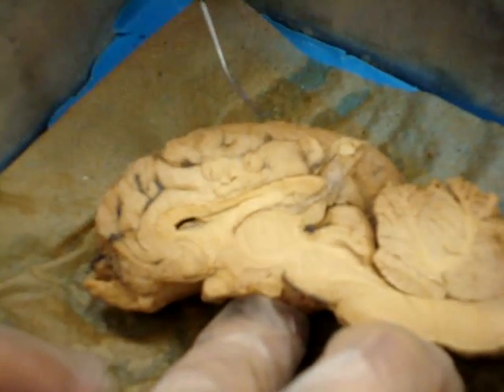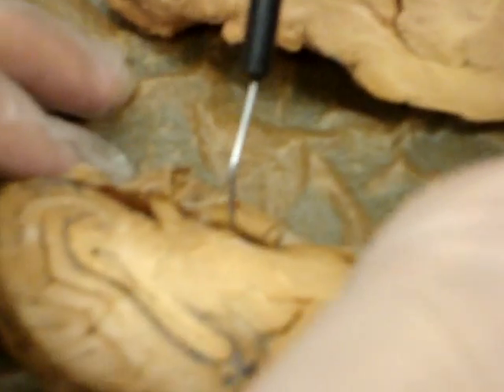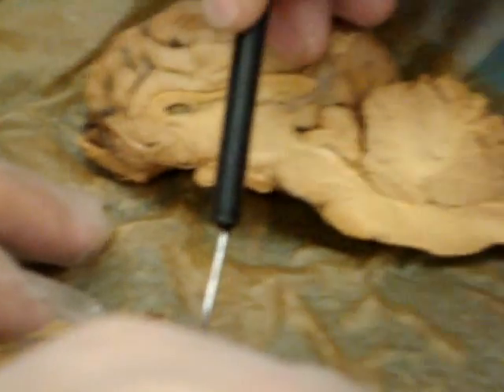the pineal gland. Did we do the thin skin? Up top? That is called the spider stuff. Arachnoid. This thick stuff is the dura mater, right? Thick stuff is the dura mater. You got it.